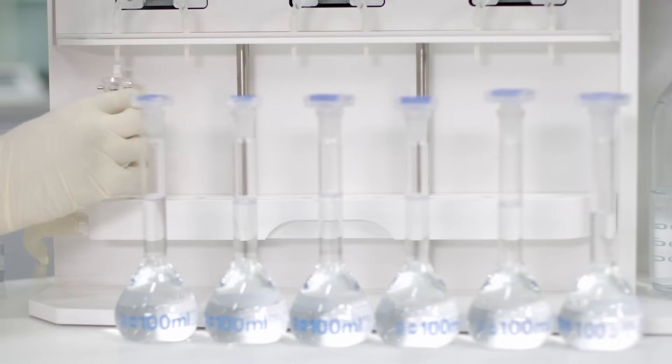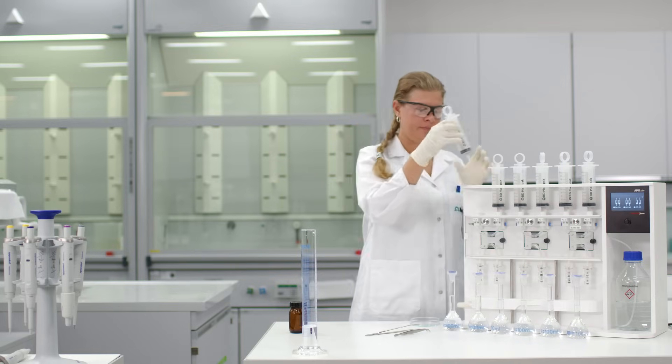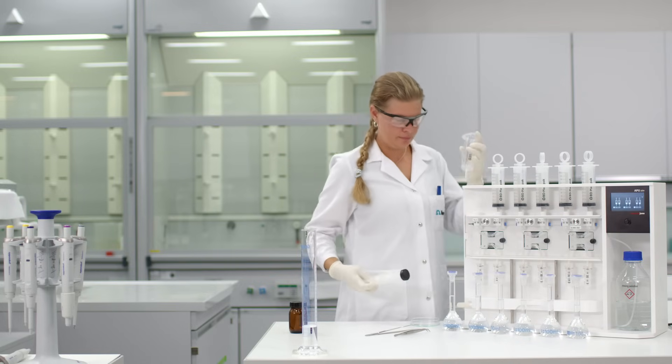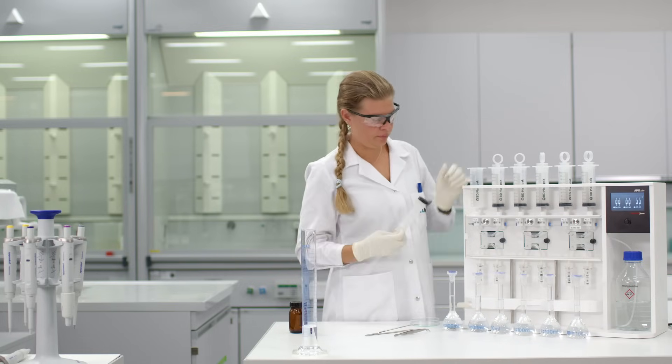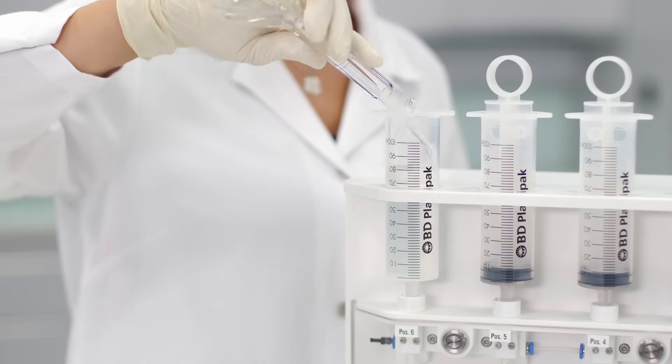Once assembled, mount the cartridges in the automatic sample preparation unit. Fill the 100 milliliters of sample into the syringes and start the pre-concentration process.